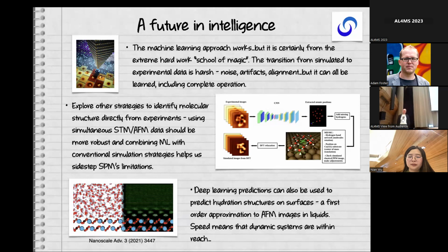No, this we don't have. The model is fixed. This would be an interesting aspect to bring back in. But there are some interesting challenges, like in these clusters, which are not this simple 2D. They even have hydrogen atoms, where Born-Oppenheimer breaks down, and they hop. And so DFT is wrong. So AFM might be right and the machine learning might be right, but then our validation, DFT, is wrong. We would have to do some Metropolis Monte Carlo, something, to actually find it.